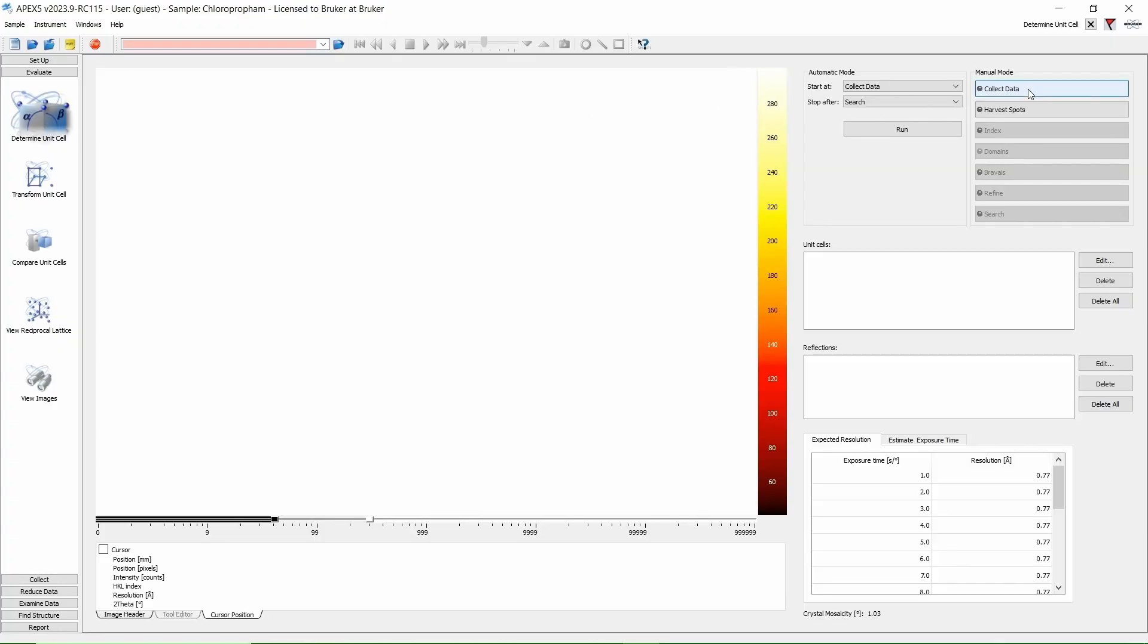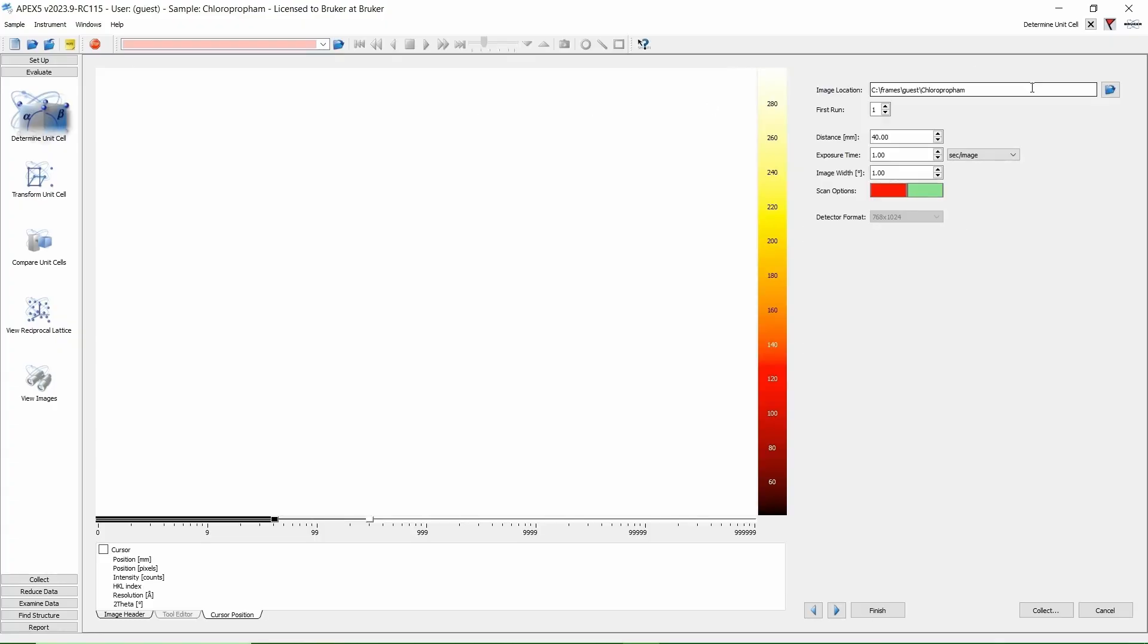On the far right, click Collect Data. You will be given choices about the detector distance, exposure time, and image width. I want to run a 3 minute fast scan so I am happy with the defaults. If you have a dual source instrument, you can change the anode here. Click Collect.